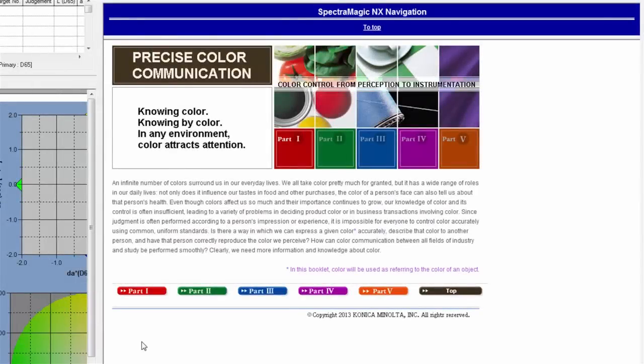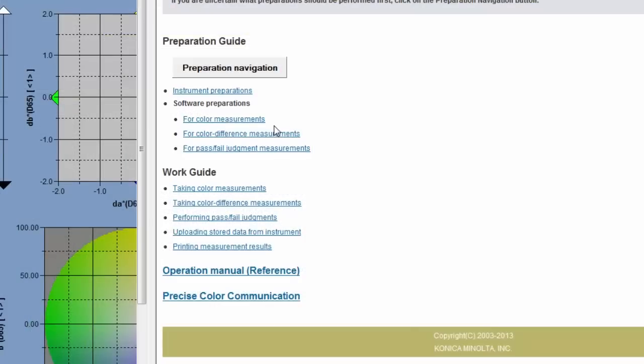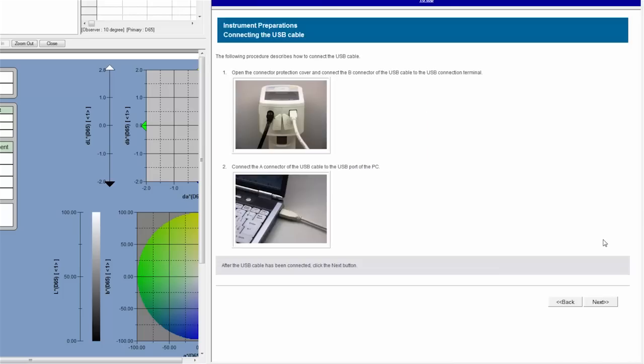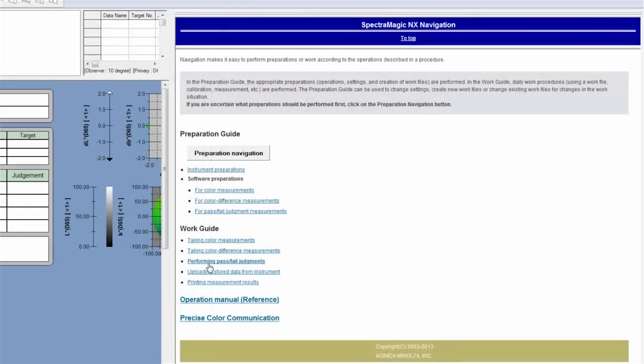SpectraMagic NX is easy to use and includes a step-by-step navigation option within the software. You can even customize this unique feature to match your individual measurement processes.